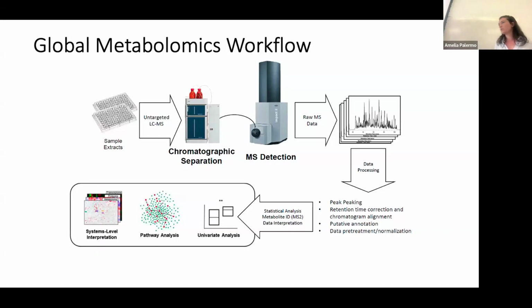Depending on their structure, they will have more affinity for either the stationary phase or the mobile phase, and that is reflected in the retention time of that specific molecule. Ultimately, this helps in identification, but also in considerations about the structure, the nature, and which part of the metabolic map the metabolite belongs to. This is very useful in interpretation and identification. Any question?